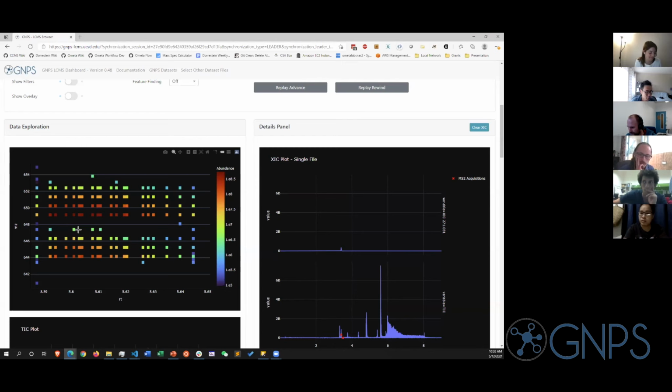One of the things that you can see very easily, at least when we did this in proteomics, is that coelution is a pretty big problem, especially for MSMS. So you can see in these 2 dimensions if there's coelution occurring between 2 molecules that starts interleaving in retention time and M over Z. That's one of the ways that I personally looked at it. But again, maybe Daniel can explain it better from a mass spectrometrist perspective.